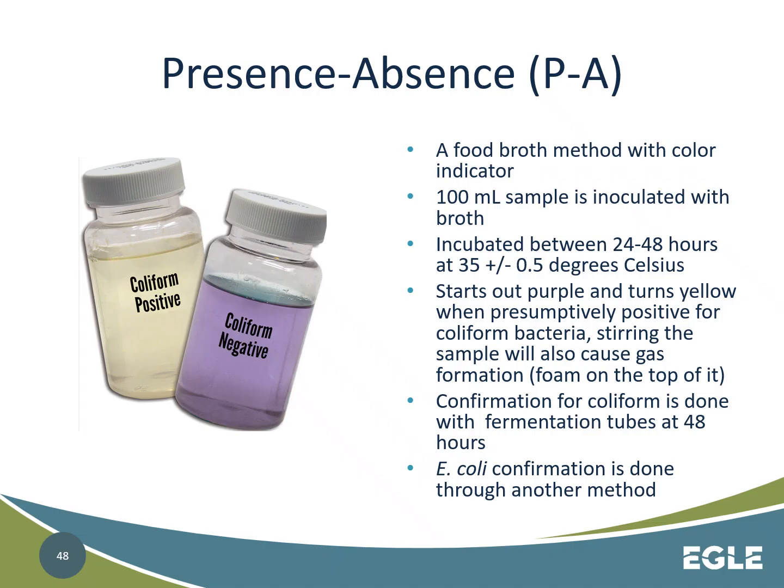It does not indicate whether you have E. coli within your system. An E. coli confirmation step is needed. Typically, you'll use another methodology to determine whether there's E. coli or not.